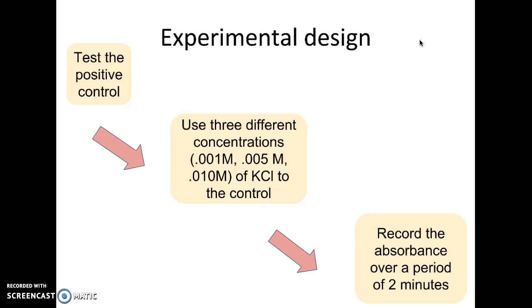The absorbance of the final solution with all the components was recorded every 20 seconds over a period of 2 minutes. The absorbance was measured by using a spectrometer with wavelengths being set to 480 nanometers.